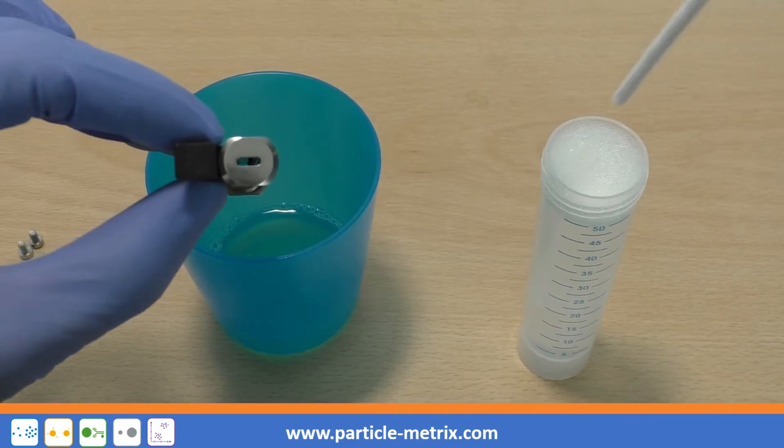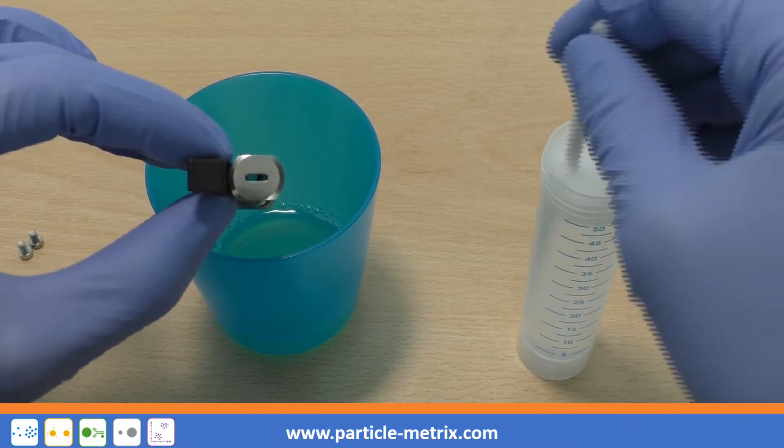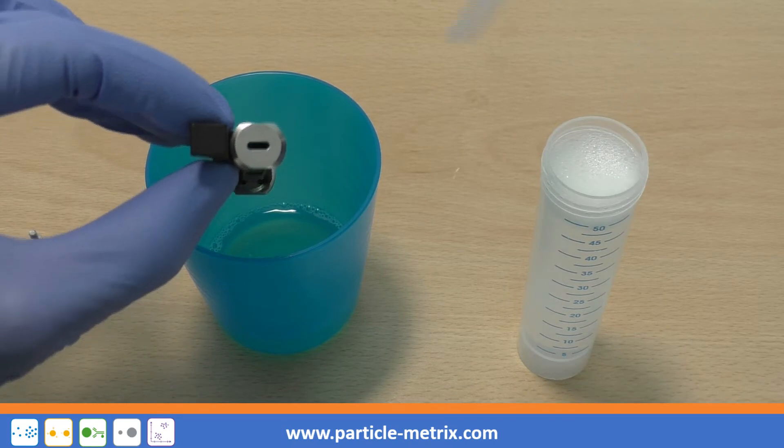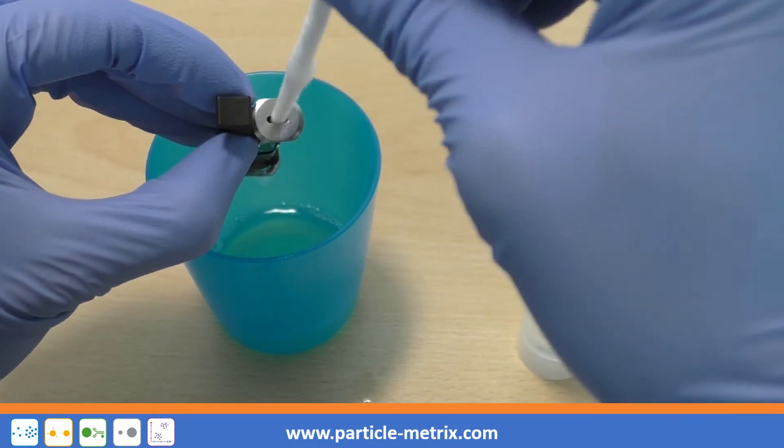After the cell has been removed, hold the cell on the cell carrier. Wet one of the supplied brushes with a cleaning solution, insert the brush into the cell and move it back and forth a few times.